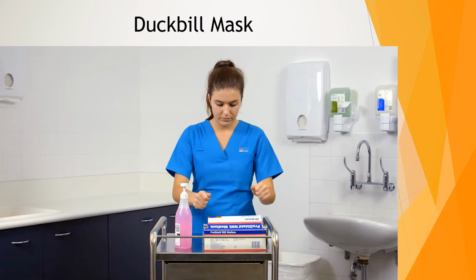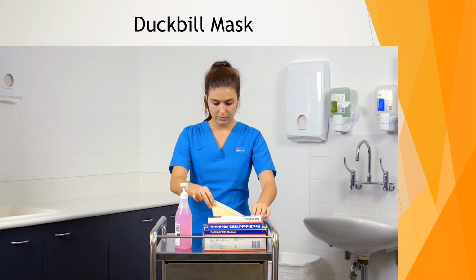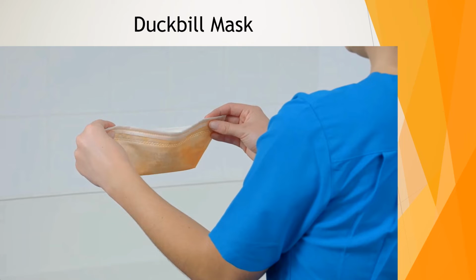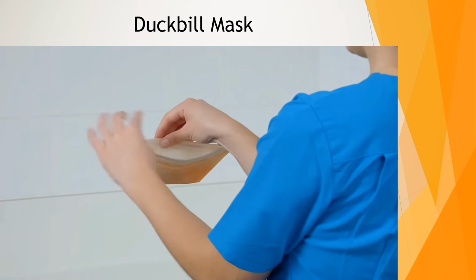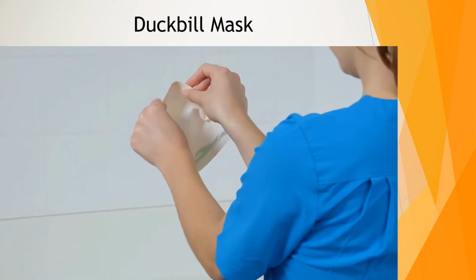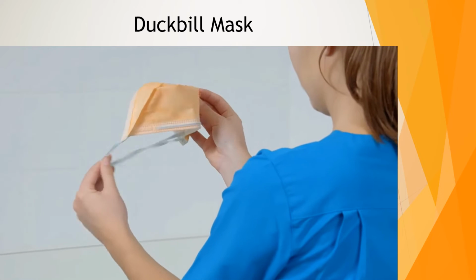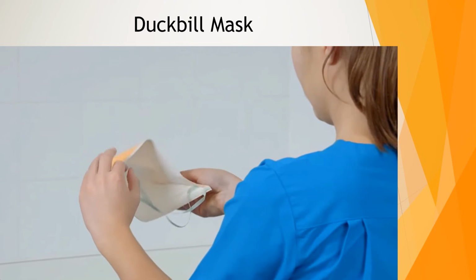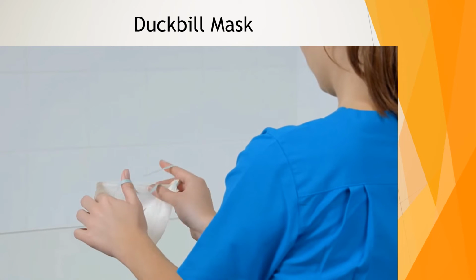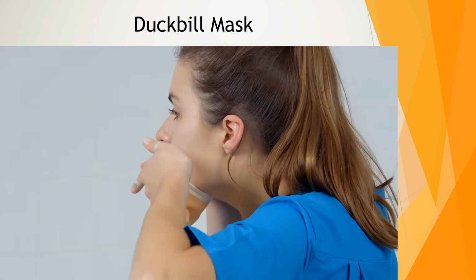To don the mask, remove the respirator from its packaging and inspect all respirator components for damage prior to each use. Separate the edges of the respirator to fully open it. Slightly bend the nose wire to form a gentle curve. Hold the respirator upside down to expose the two headbands. Using your index fingers and thumbs, separate the two headbands. While holding the headbands with your index fingers and thumbs, cup the mask under your chin.